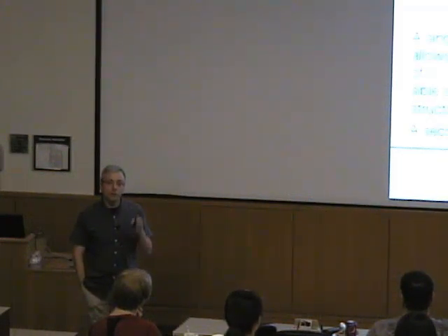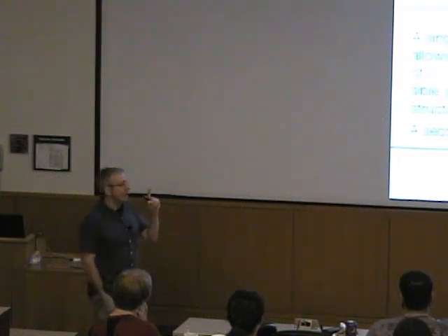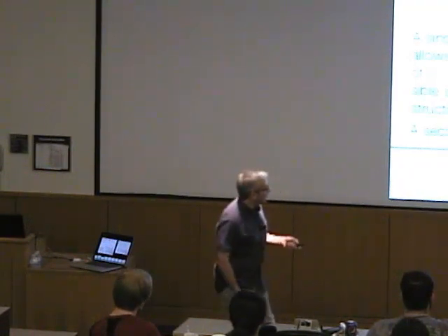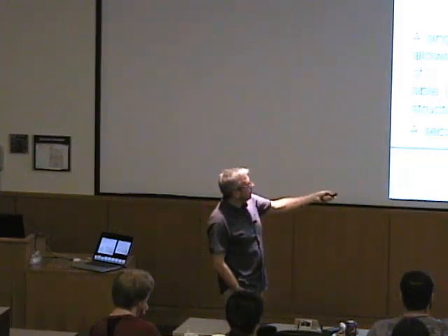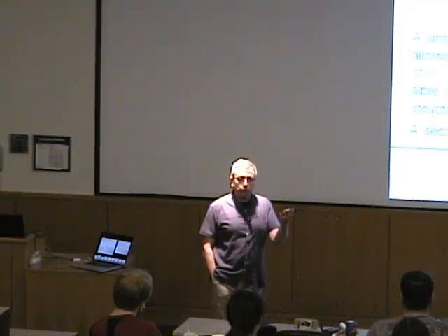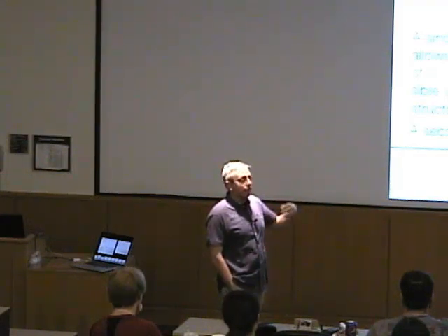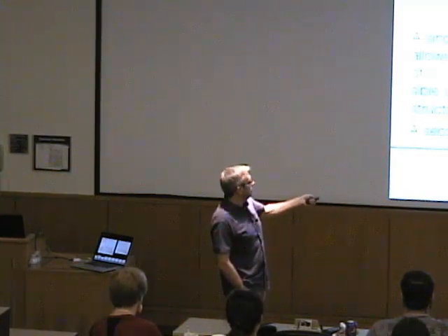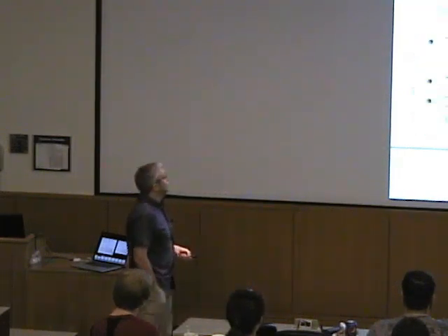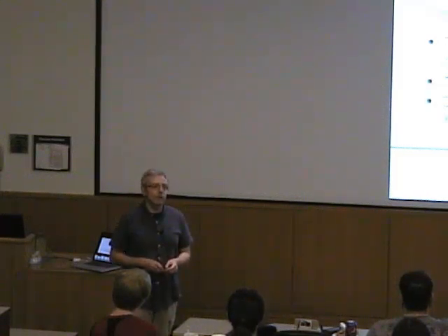Okay? And that we can calculate for every single reflection, just by knowing the small structure of the heavy atoms, the substructure of the heavy atoms. That's actually quite nice. We still have an ambiguity here, two possible solutions for each reflection. That is too much in order to just guess. But if we have a second heavy atom, for example, or another source of information like anomalous scattering that I talk about in a second, that ambiguity is lifted and we can calculate phase angles. And out of that, you have these moments when you push your button and the electron density pops up, like you go to your practicals.